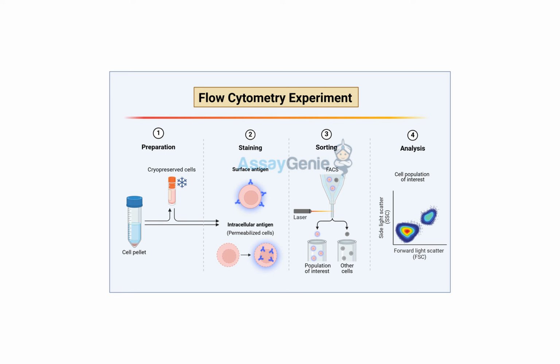We've covered a lot of ground so far. We talked about how to get antibodies into those cells without destroying them, how to make sure those antibodies are binding to the right target. It's all about specificity. And even how to untangle those fluorescent signals using compensation. So I feel like we're well on our way to becoming microscopic detectives. We are, but there's still more to the story. There's always more.